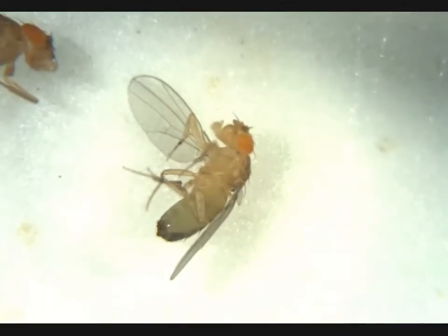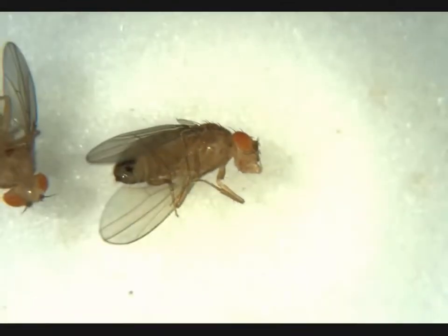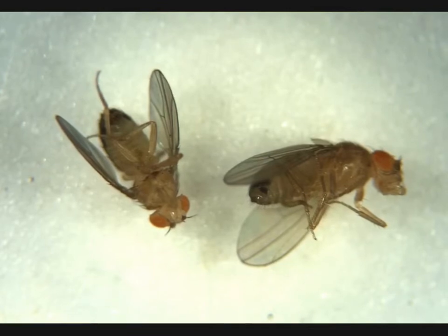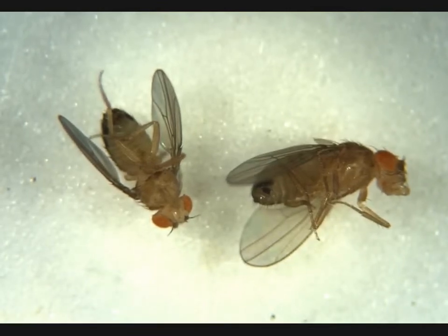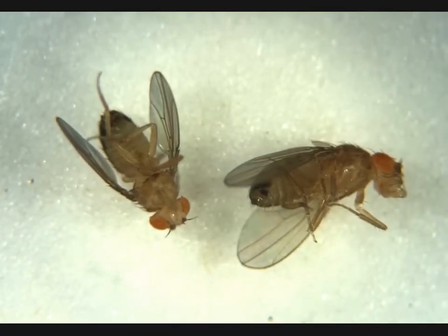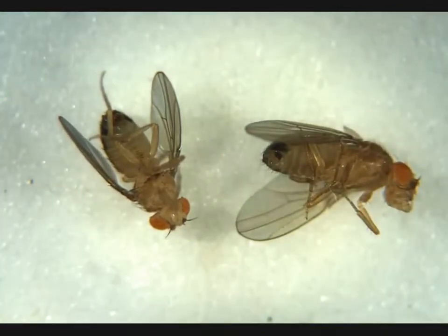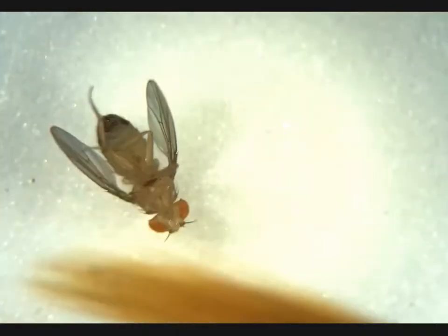Next we have another male. Penis apparatus here — we don't need him. This is another female. No penis apparatus here, no visible meconium, so she's an adult female. We can adjust the focus and see that this is a penis apparatus on this male. No visible meconium, so he would be adult.